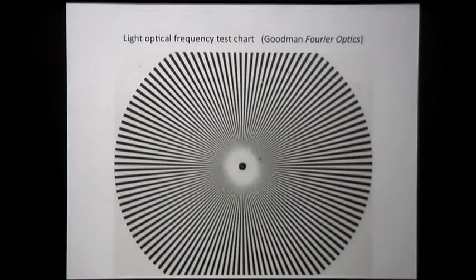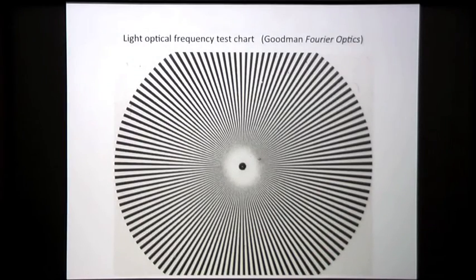And you can demonstrate this by an optical frequency test chart. I'm sorry, this makes me feel ill to look at. I won't keep it up long. It probably makes you feel ill as well.